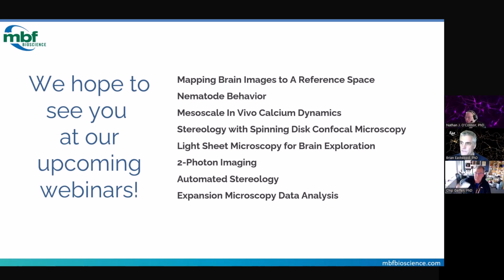And there's Chip's holder for specimens. We have the specimens where we can do 2 brains with this, and it's individual wells. We put the brains in, and then it fits into a dish so that there's a minimal amount of volume. This is what we use. And the 3D printing files are available online for those who want to 3D print it. Yep. So I'll make sure that we send out a link to your Current Protocols paper, Chip, and then our JCN paper on the development of the method, which goes through some validation as well.